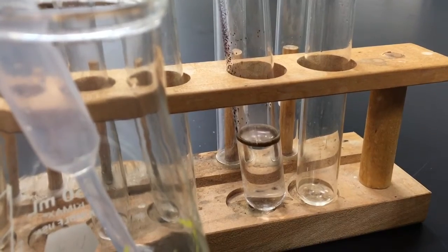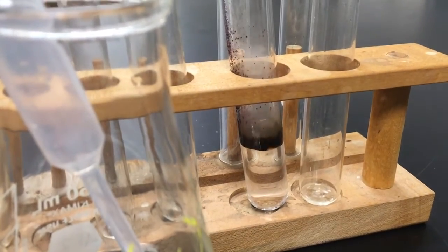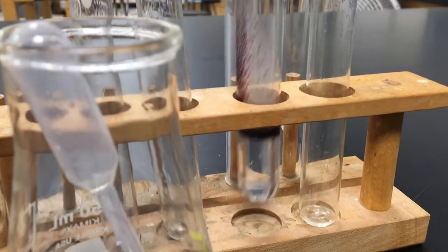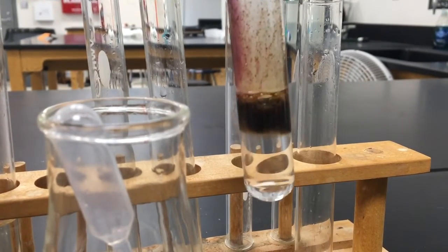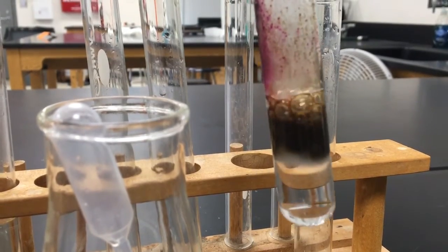I'm just going to add a little bit more because half of that got stuck on the side. I was watching the video instead of the spatula. Stir that to get it mixing and reacting a little bit better. A little shake.